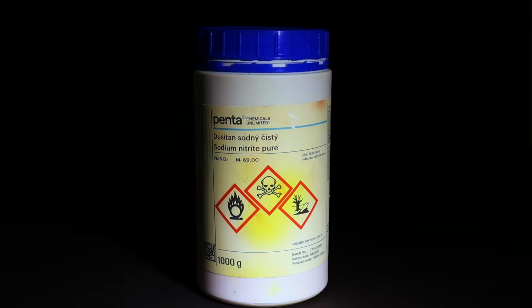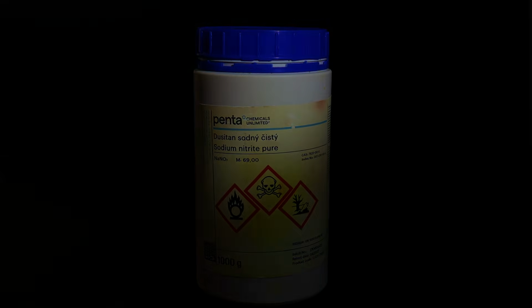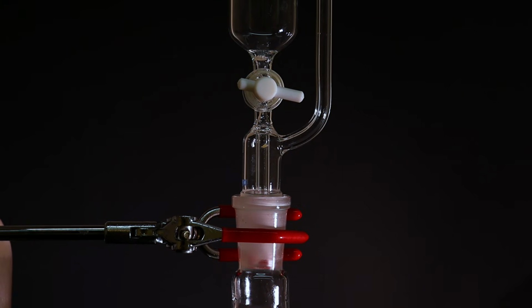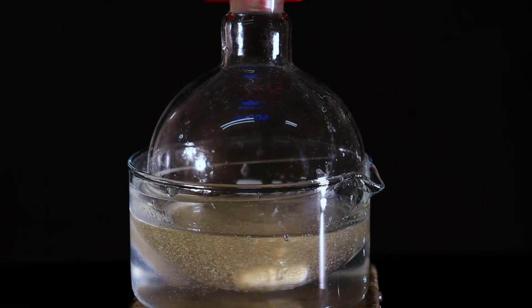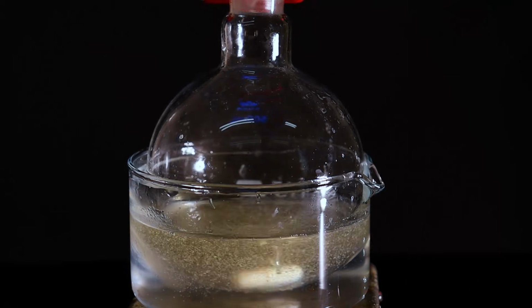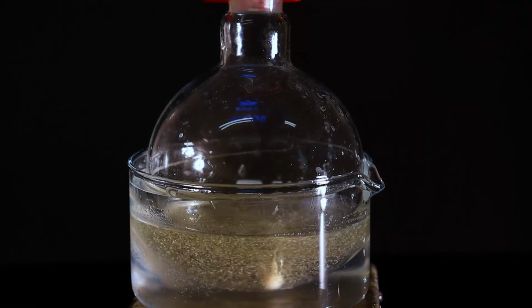I continued with dissolving 5.5 grams of sodium nitrite in 12 milliliters of water. That will create our diazotization solution. Next, I transferred all of the nitrite solution to an addition funnel that I attached to the flask. Now I am ready to start the next reaction. I very carefully open the stopcock on the funnel, and I adjust the drop rate to about a drop every 2 seconds, while maintaining the temperature between 0 and 5 degrees Celsius.